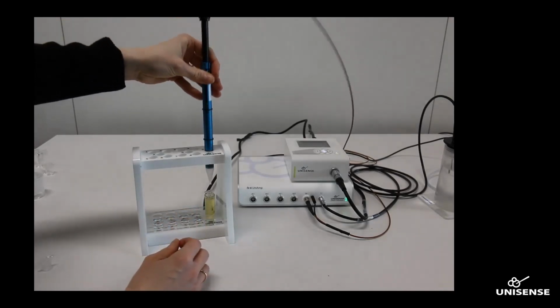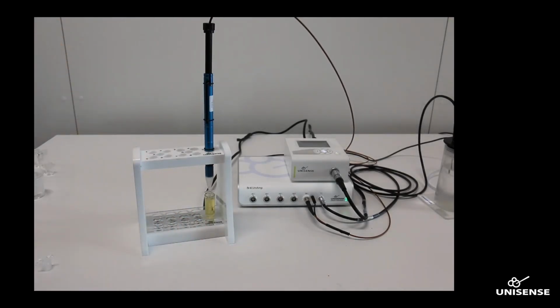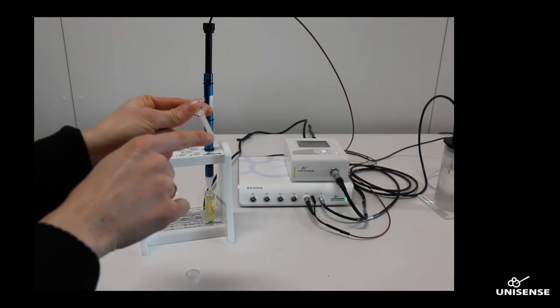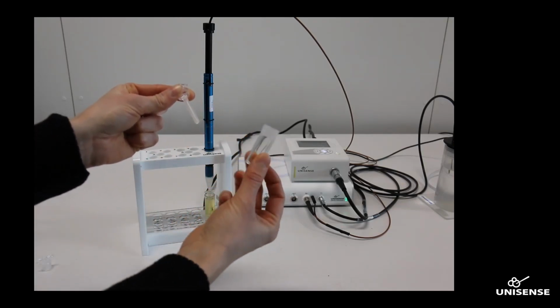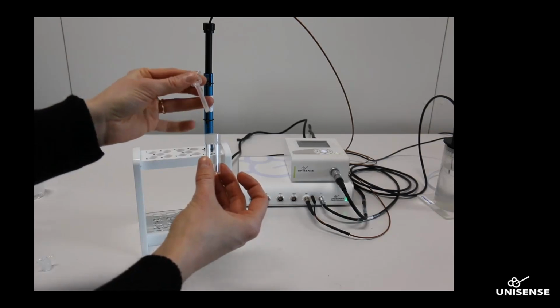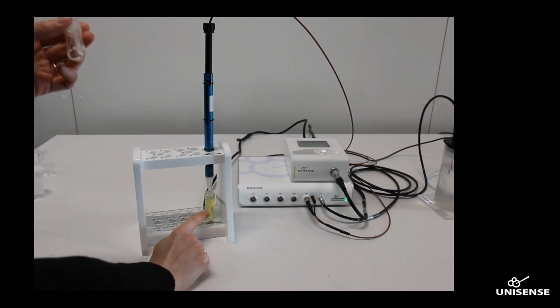Good. So over here I have a 0 calibration chamber, and this chamber has a special lid with a silicone tube. And I have filled the silicone tube with water, and then I have filled up the glass chamber with an ascorbate solution that has no oxygen in it. When I then put the lid with the water and the silicone tube into the ascorbate solution, as over here in the rack, the ascorbate will remove the oxygen from the water inside of the silicone tube.